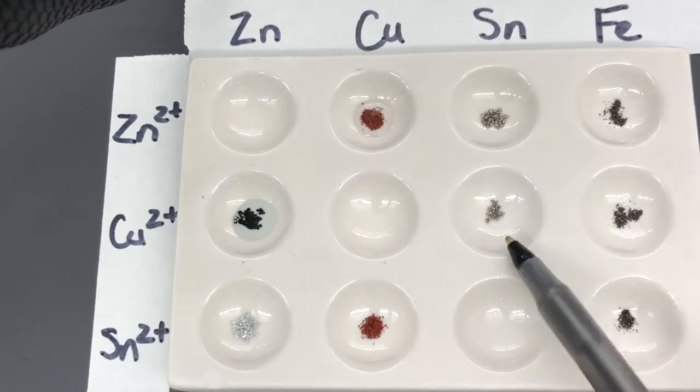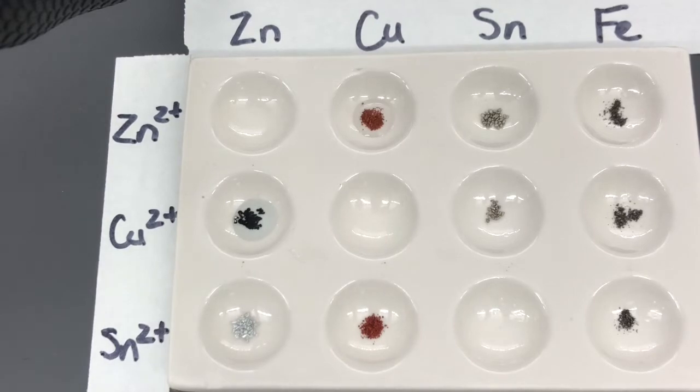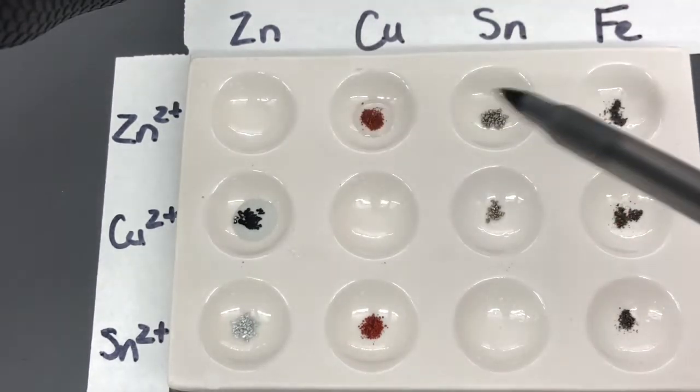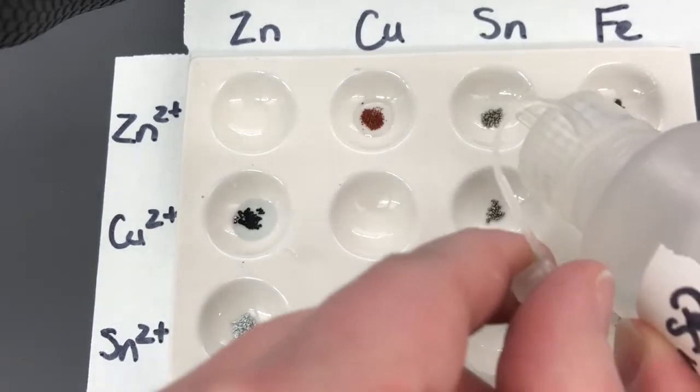I have tin in the 3rd set of wells, and I have iron in the 4th set of wells. Just like I did in part 1, I'm going to add the cation solutions to each of the metals, and we'll observe what happens. So we'll start with the zinc 2+, and we'll add some zinc 2+ to the tin.